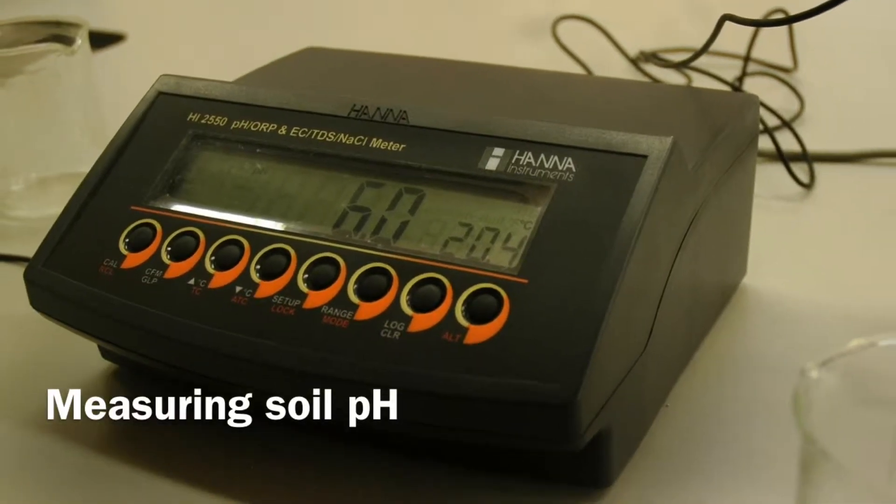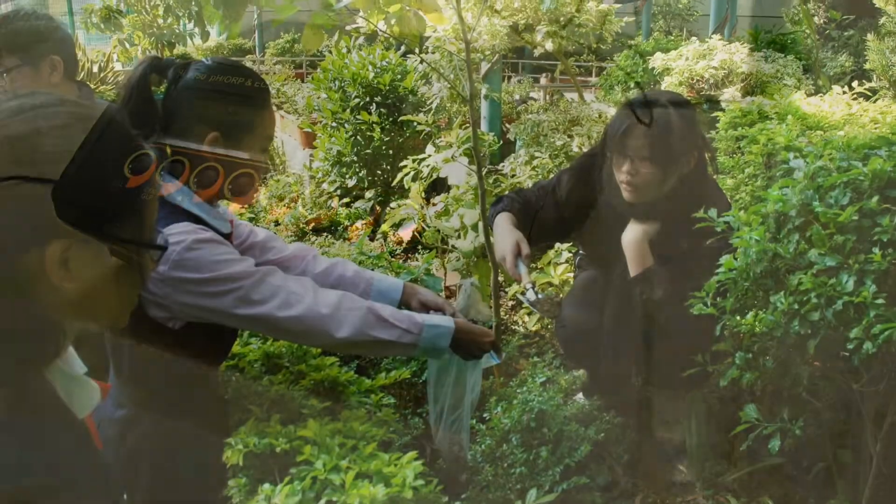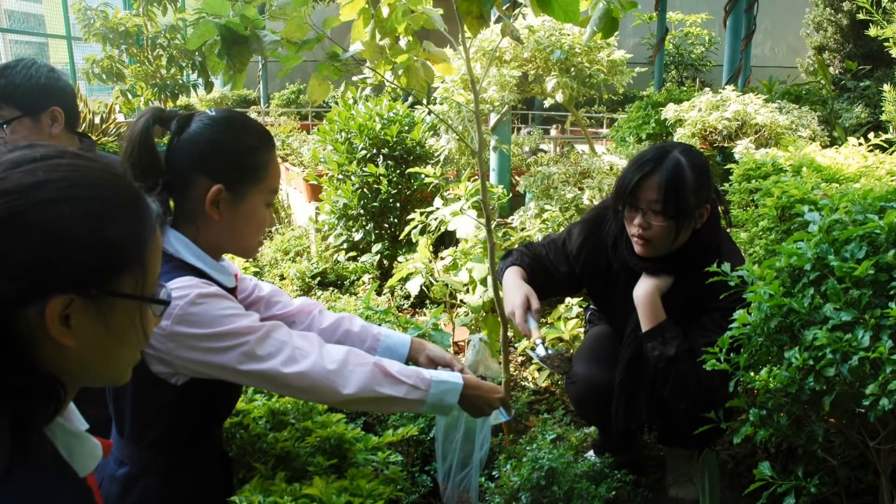Measuring soil acidity. Collect the soil sample.